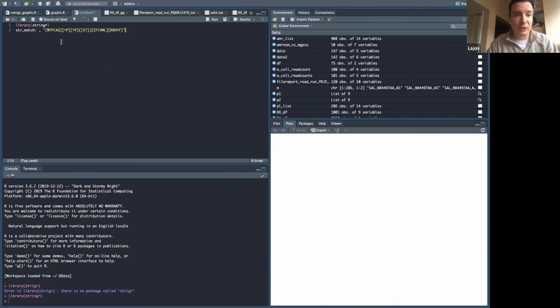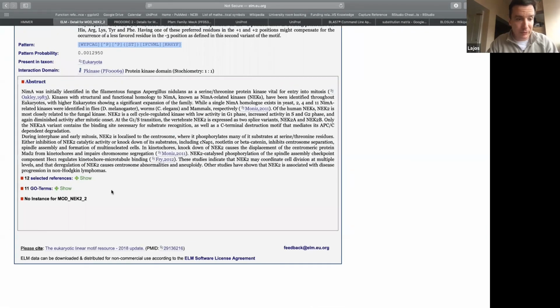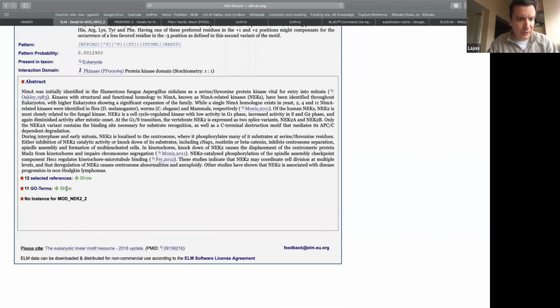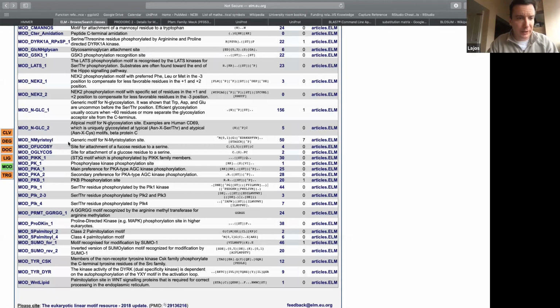So this is what you just simply copy here, and the str_match will understand it. Even if there are brackets, it will understand. And for here, I will just put in one of the sequences where it can be found. Oh, we don't have any sequence here. No instance. Oh, I was able to find the one where there is no sequence for it.